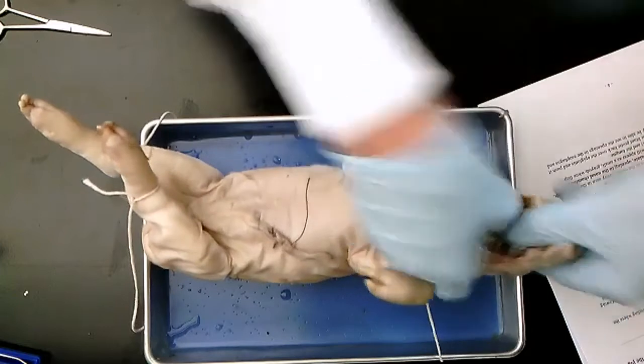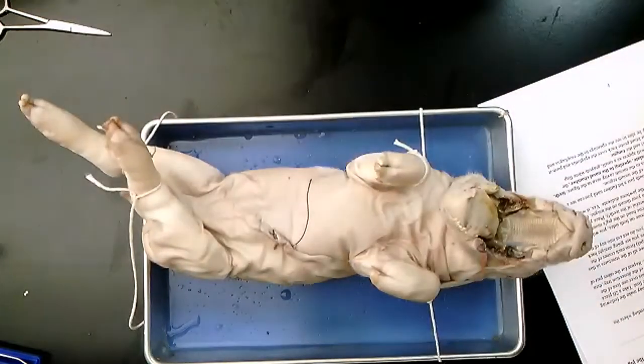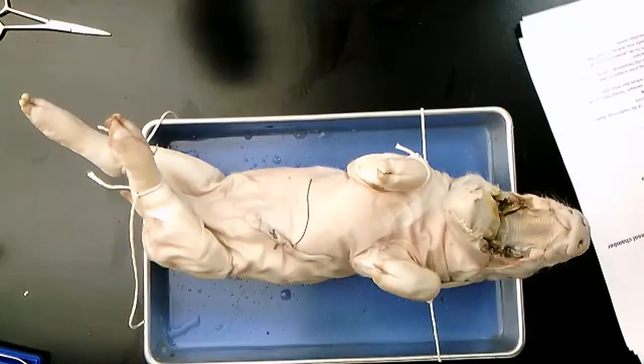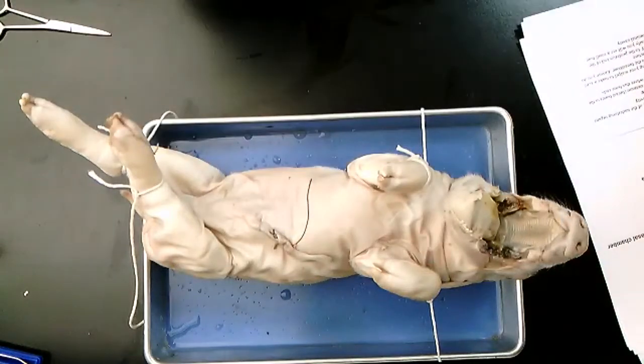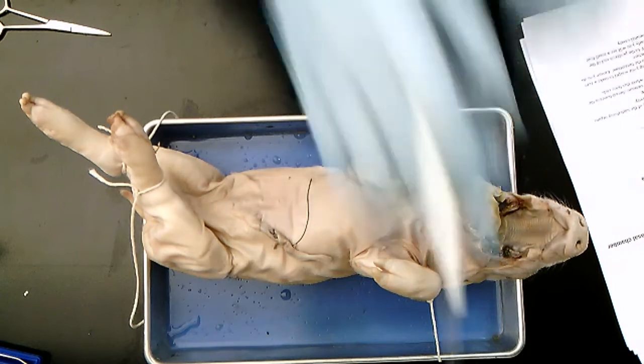And don't be shy. Just break it apart. It's okay. All right. So after you've done that, there's several areas of identification in the mouth. And it's going to be a little hard to see on this video, but we'll try our best.